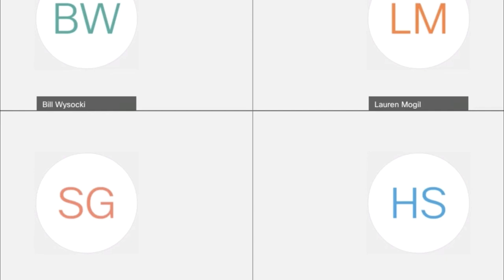Anything that we process in the near future will be done with Cell Ranger and Seurat, since that is the current single cell RNA pipeline that the GDC uses. But in the future, there may be additional data sets and additional pipelines. For now, this is what we have. And Cell Ranger is constantly updating, so in a few versions, there might be something like that provided as well.